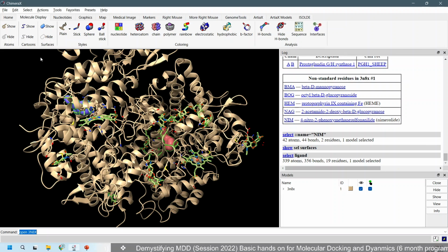Okay, sir. Basically, I have a challenge to find out the same thing in Chimera also. Yeah, if you don't find that, just go to Google, type Chimera show surface. There will be a tutorial or some official documentation for you. I will also make you walk through official documentation of any software so that you don't have to struggle and you will be finding solutions yourself.